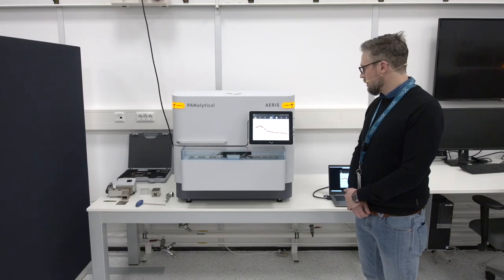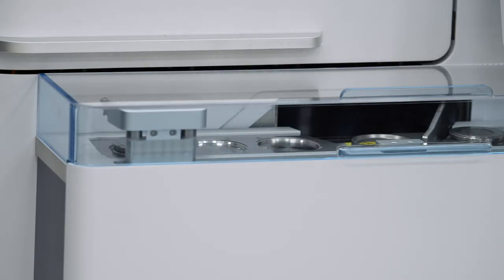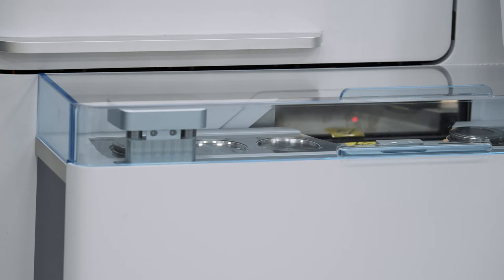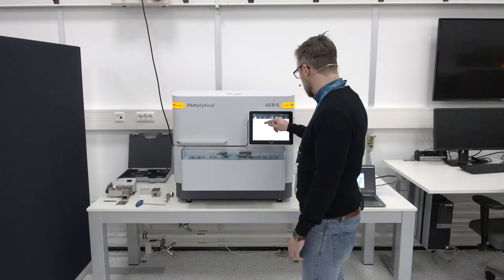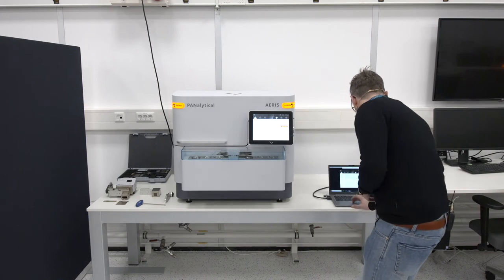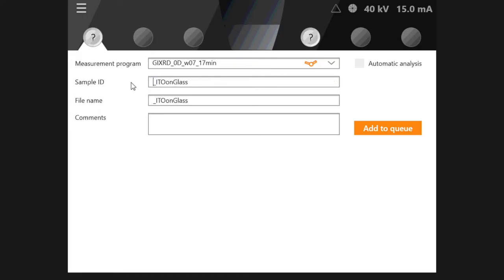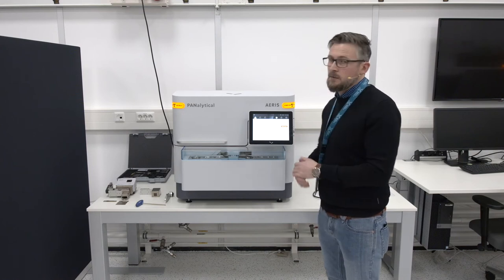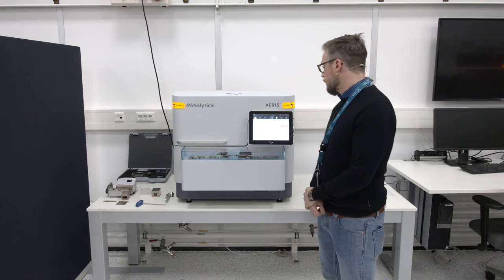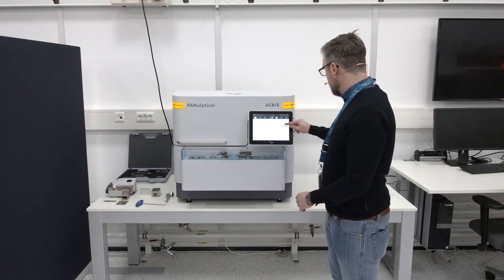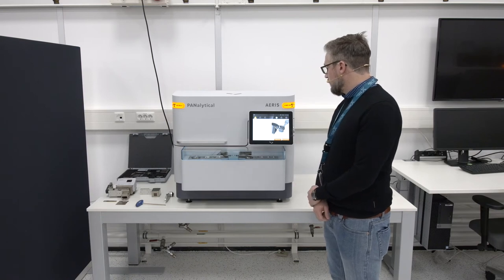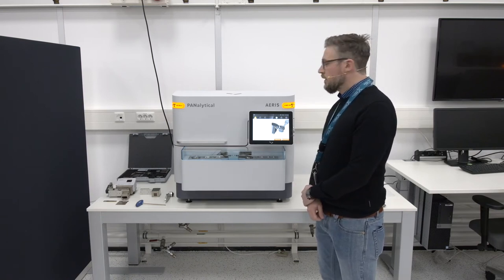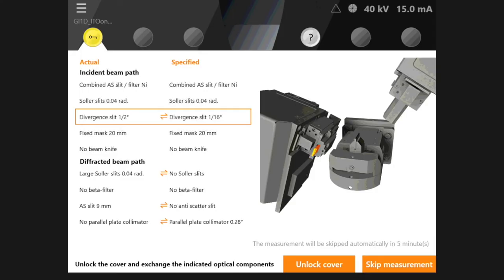The measurement is done and we will now start the grazing incidence measurement. I have also pre-prepared a grazing incidence measurement program. This measurement covers the exact same angular range that we saw in the Bragg-Brentano measurement, however at a constant angle of incidence of 0.7 degrees omega. Now that I have selected the measurement program, the instrument reminds me to change the setup and specifies the components that I need to change.